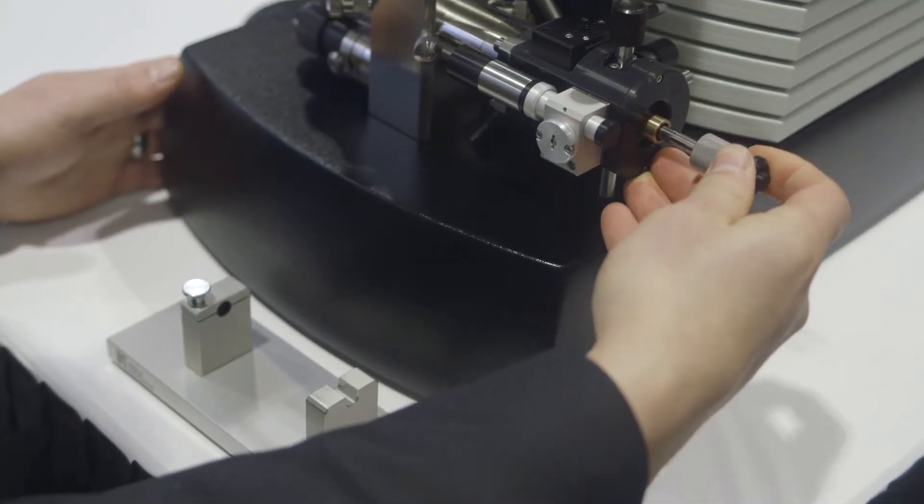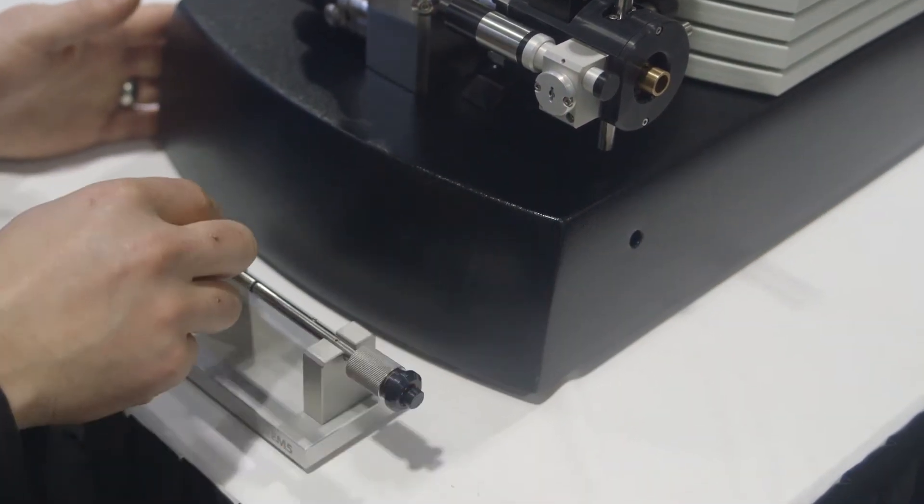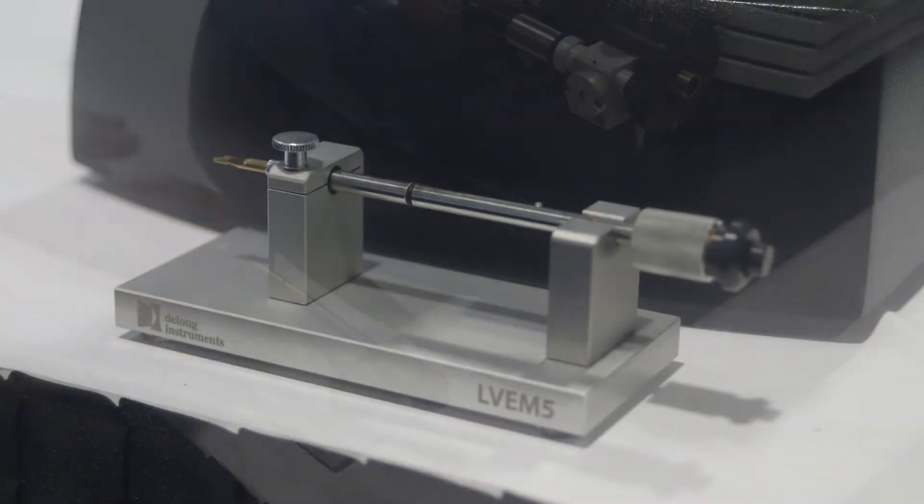The LVEM5 features resolutions as good as 1.2 nanometers. While the LVEM5 excels in most materials and life science applications, it is ideally suited for use in nanomaterials characterization as well as educational applications.